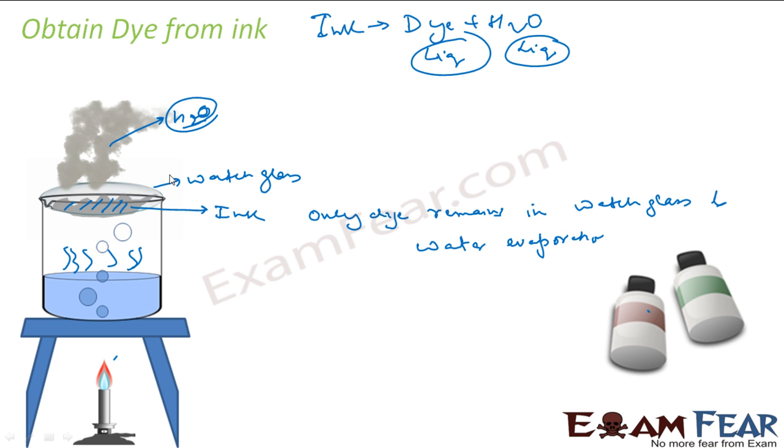We wanted to prove that this ink has dye. So when you heat this ink, after some time you get this dye. The water is gone. Please do not heat this watch glass directly. Use this water vapor, water as a medium. Don't heat the ink directly. You can stop heating once you see that no more water vapor is coming up and you see the whole dye here. So from the ink actually you can get the dye. That means ink is actually a mixture of dye and water.